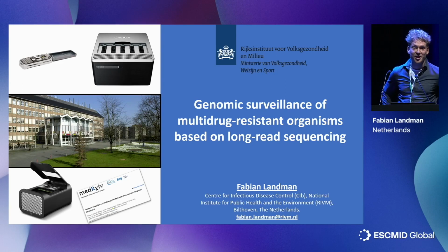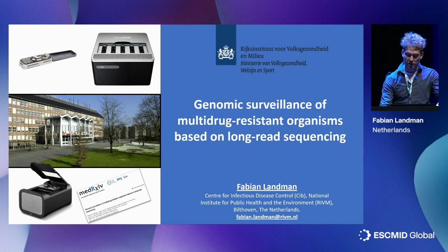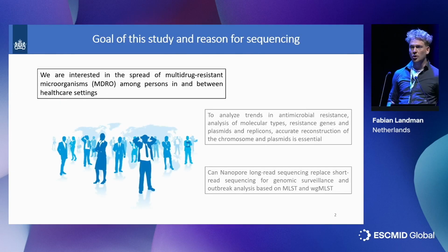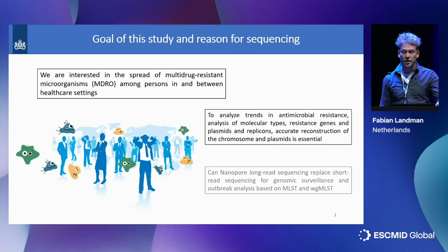I work at the Dutch National Institute for Public Health and Environment, and today I would like to present our work on how we do genomic surveillance using long-read sequencing data with Nanopore for the genomic surveillance of multidrug-resistant organisms. The goal of this study is that we are initially interested in the spread of these resistance genes amongst these multidrug-resistant organisms, among persons and in healthcare systems.